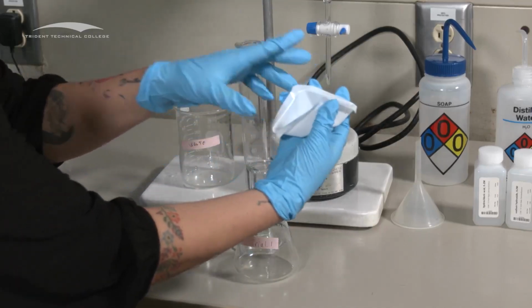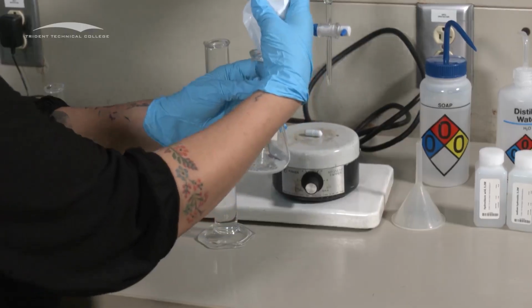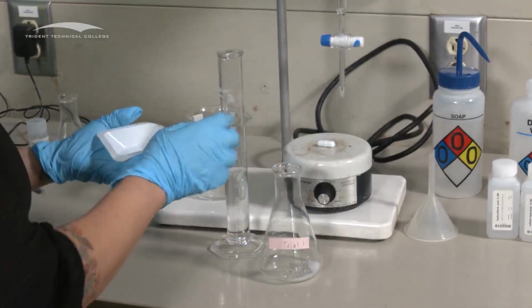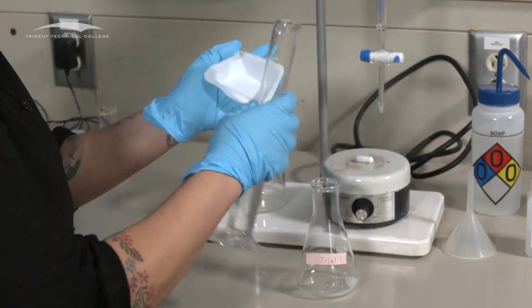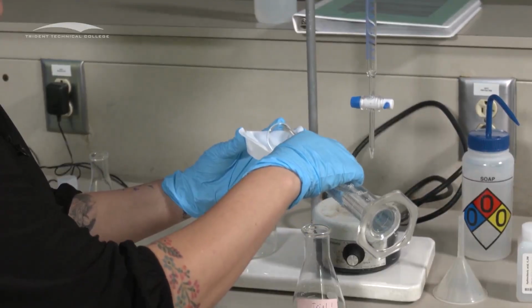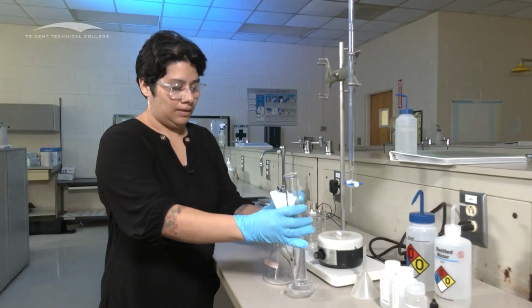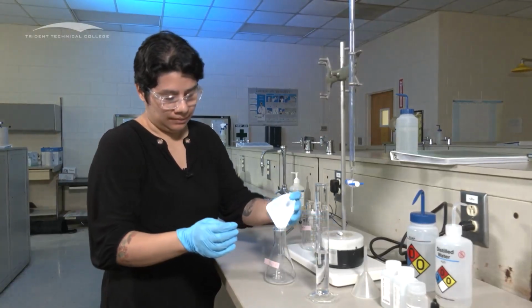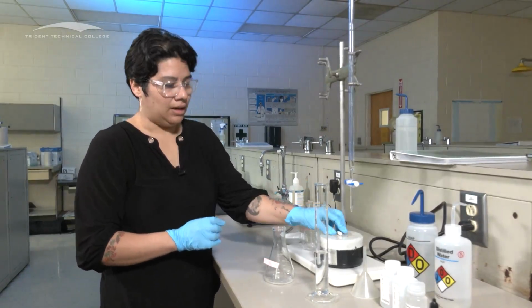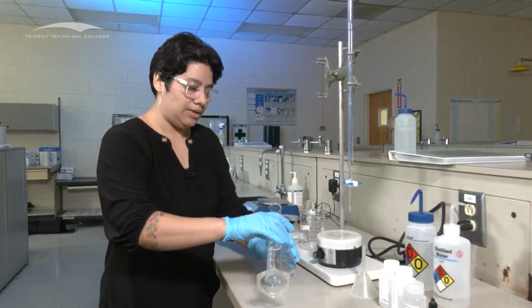To do so, you're going to take your weigh boat and you're gonna flip it like this, and it goes in there. If you need to get any extra solid out, you're gonna use some of your pre-measured water. It helps if you have a little pipette and just put a little bit of it. Don't get any extra. It has to be some of your pre-measured water. And then it will go in there. And then we need our little magnetic stir bar. Put it in there. And then the rest of the water goes in.